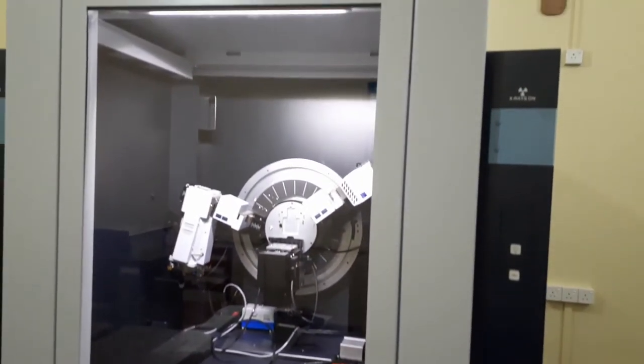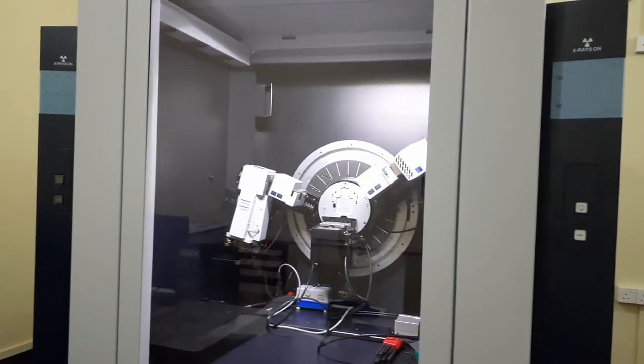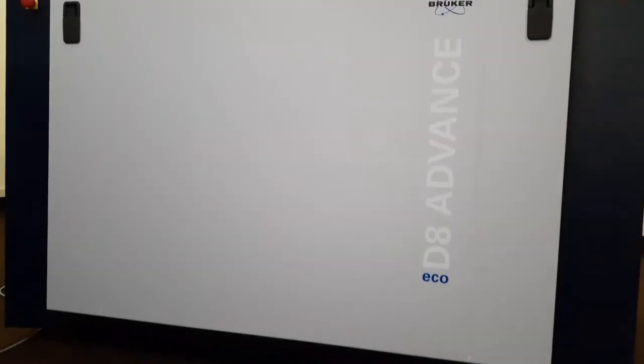From this video onwards, I will cover the complete operating procedure and some advanced techniques involved with the Bruker D8 Advance Eco XRD machine, which is powered by a 1 kW X-ray source and SSD160 detector system.